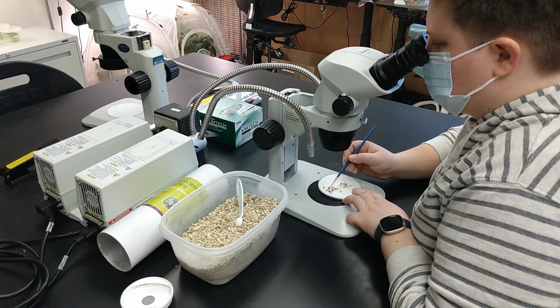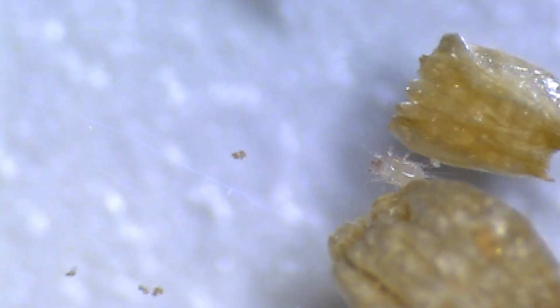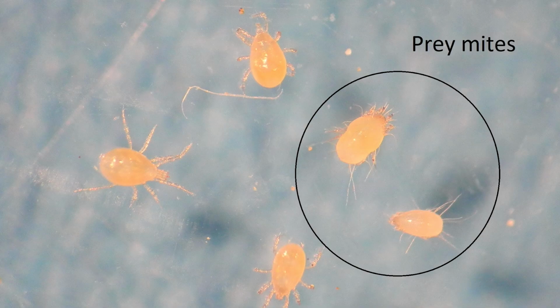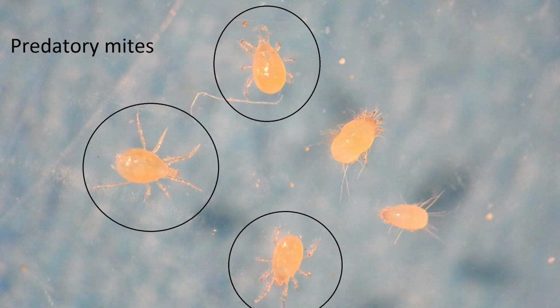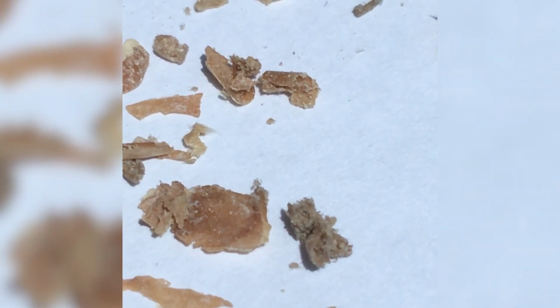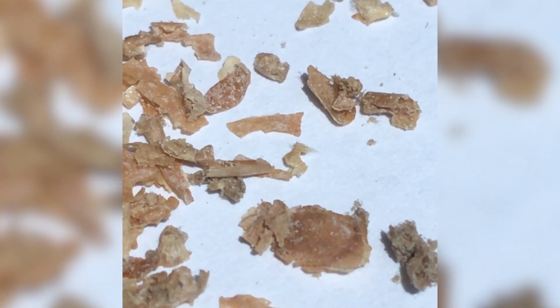mites in the line. If you are checking a product that contains feeder mites, note the difference between feeder mites and predatory mites. Feeder mites are slow-moving, milky-colored mites with long hairs, while predatory mites are fast-moving and smooth. Be sure not to count food mites during your assessments. Take care to separate the pieces of carrier well using the paintbrush, as mites may hide between pieces.